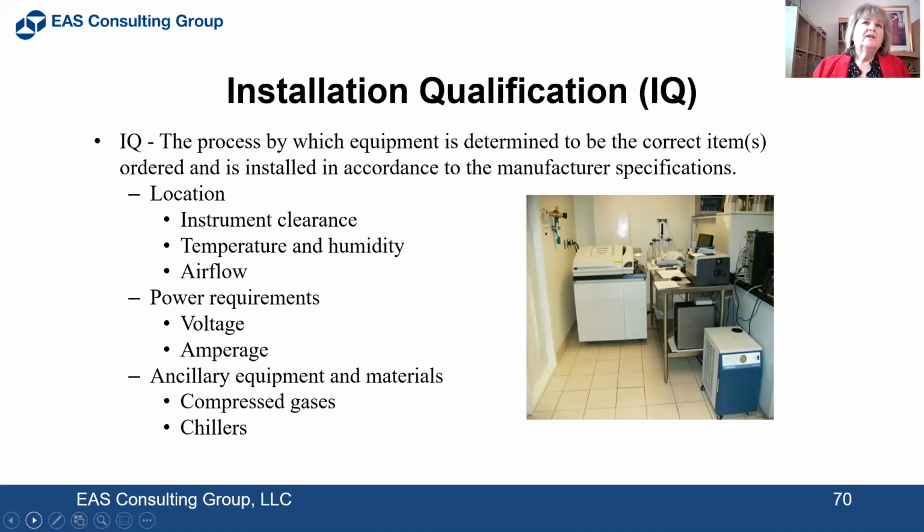Your installation qualification, your IQ, is the process by which equipment is determined to be of the correct items ordered, and is installed in accordance with the manufacturer's specifications. This is not a very long or technical type of protocol.